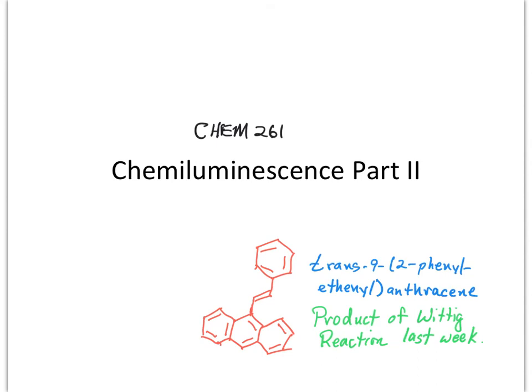This is our introduction for lab next week since we have a test this week. So we're going to complete our synthesis of a chemiluminescent product. Remember last week we made this large conjugated molecule that was fluorescent.